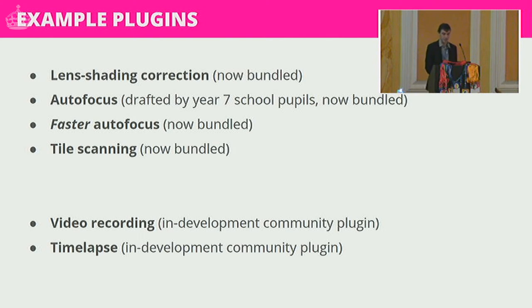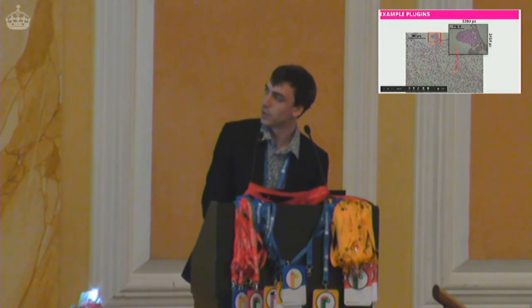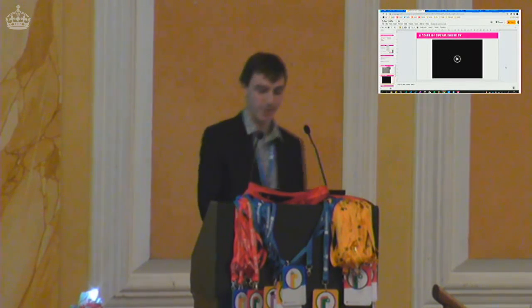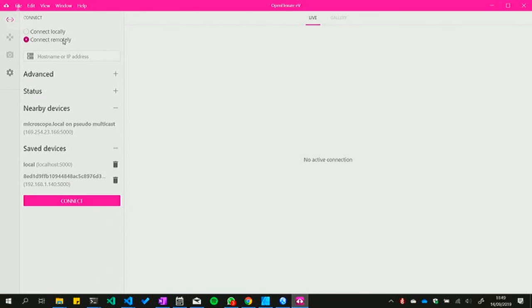Tile scanning is particularly important — you can just set a scan running and come back after lunch. A single 8-megapixel image of a blood smear versus a 400-something megapixel image stitched from a 10×10 grid of images: really rapid data acquisition. I was going to play a video of me using the microscope, but I'm going to try and do it live. This is our flagship front-end application.